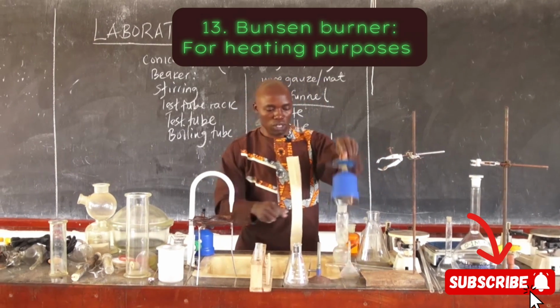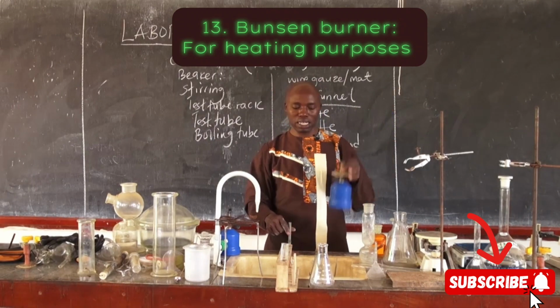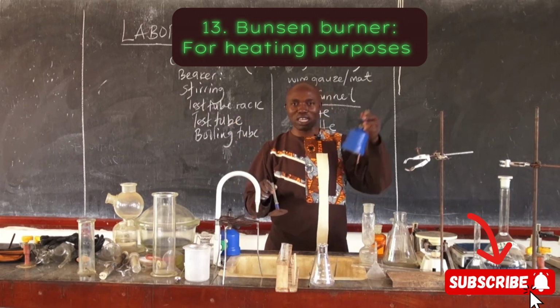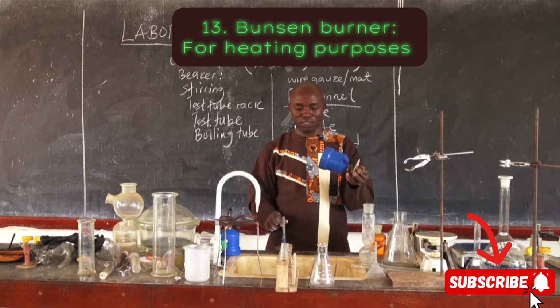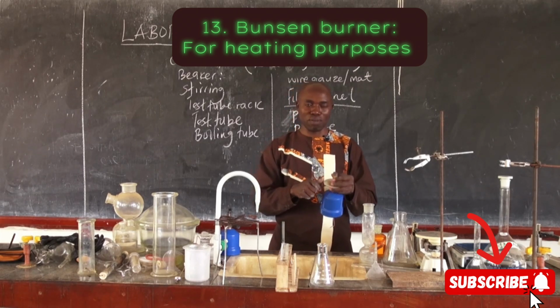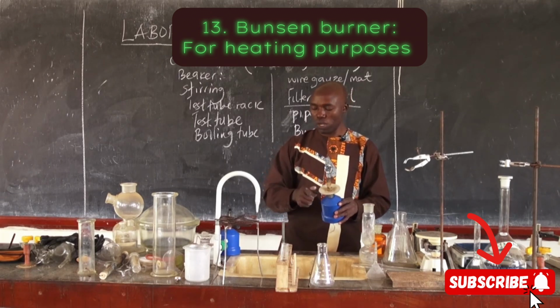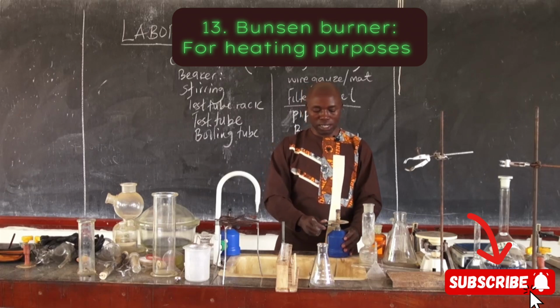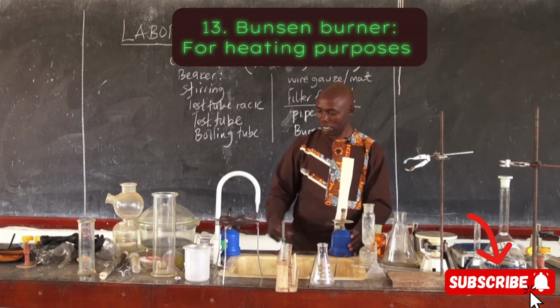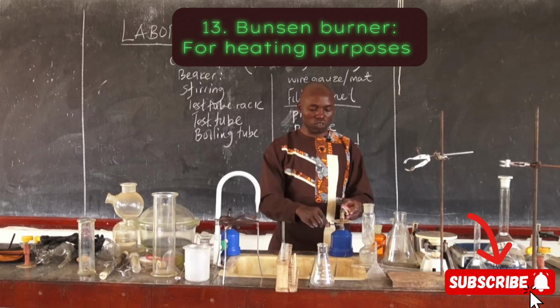Let me talk about what we call the Bunsen burner, or normally these days we call this one a gas burner. This one is the original Bunsen burner. Because of technology and advancement, we are adopting these ones which are very portable, and they have an inbuilt gas here which you can always refill when it is over. So this one is called a gas burner or also a Bunsen burner. We normally apply our flame to this, then it lights, and we can use it for heating experiments. So a Bunsen burner is basically used for heating.